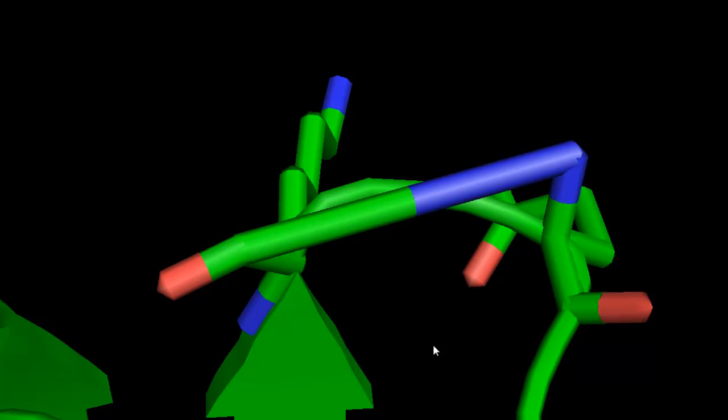The only way to see whether this loop really looks like this will be to solve the crystal structure of this mutant and then look at it through PyMOL that way. Obviously, that's not very practical at all.